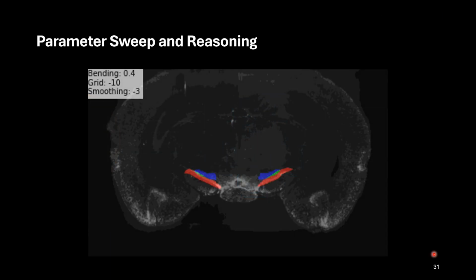And just to show you what this looks like, the red is what was annotated as the ground truth, and the blue or purple is what the different parameters are calling as the SNpc region. So you can see the region shifts around and jumps around quite a bit. I'll also highlight that the blue region looks a little bit different to the ground truth because this was done using an atlas that was developed specifically for tissue cleared images. And you can see there's quite a lot of variability.